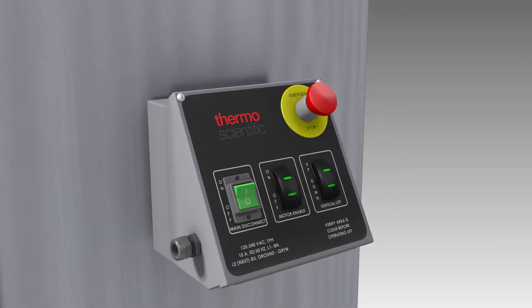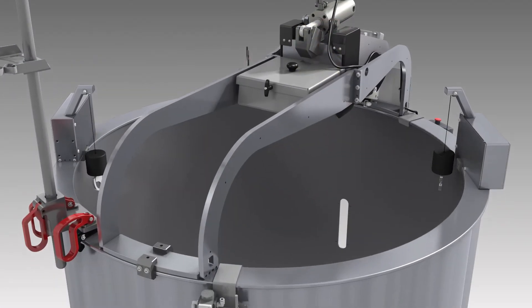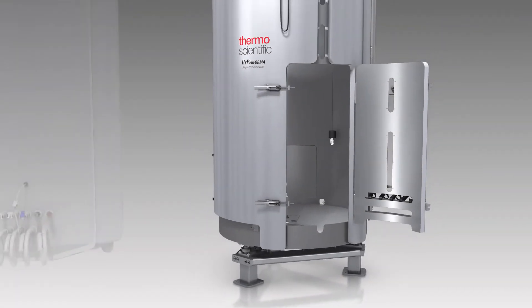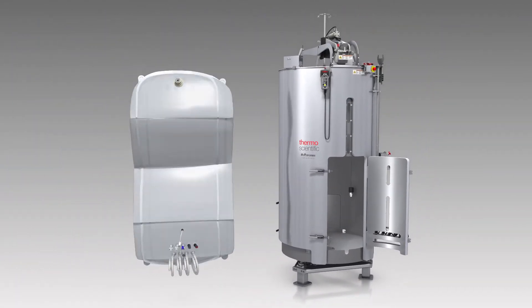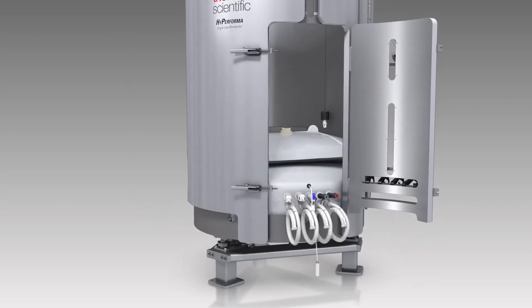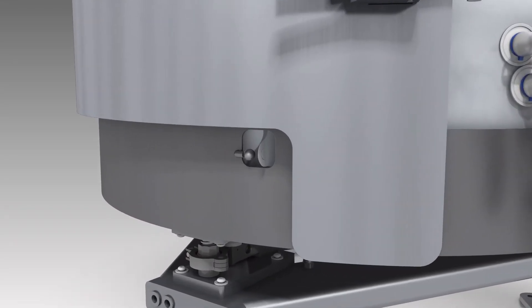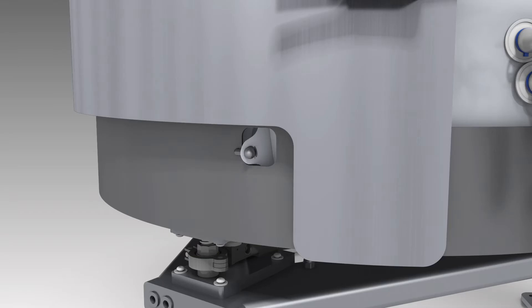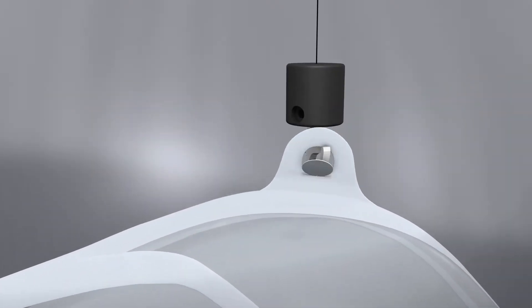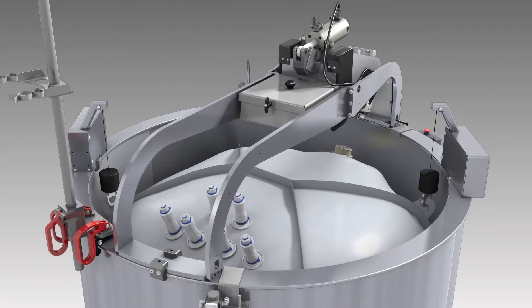Simply lower the BPC hooks with the BPC lift control. Place the BPC inside the vessel, connect the hooks to the BPC hook tabs, and raise the hooks until the BPC settles into place.